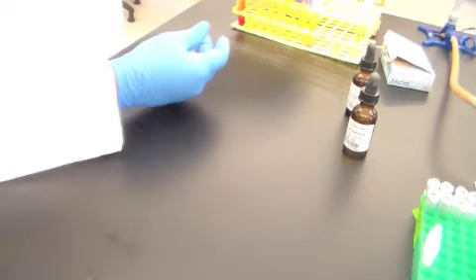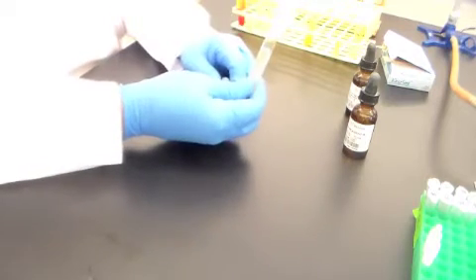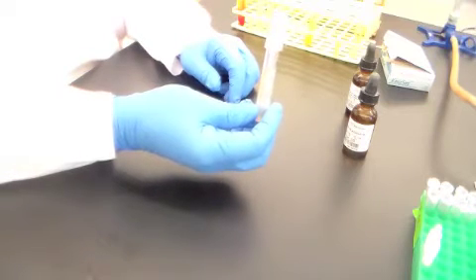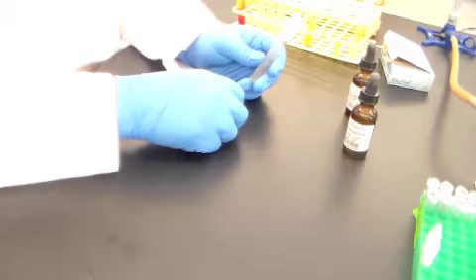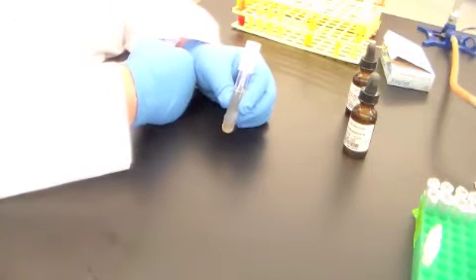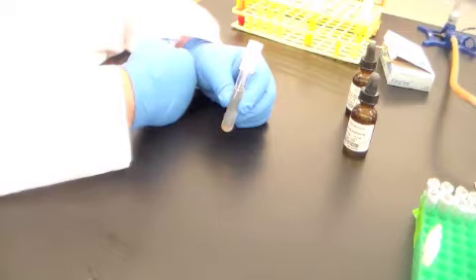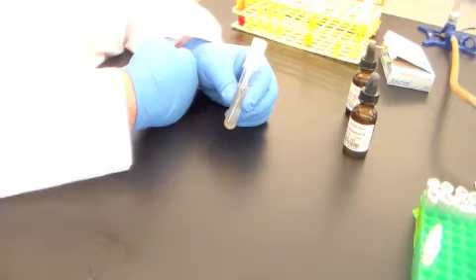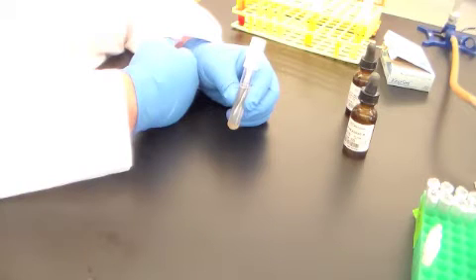So I have inoculated other nitrate broth cultures with a consortium of soil bacteria, which is kind of a fancy pants way of saying I put some soil in here and let it grow. The idea being that soil microbes, remember we talked in lecture about the bacterium Paracoccus denitrificans. That wonderful little soil bacterium is a facultative anaerobe. It has the ability with its electron transport chain to reduce oxygen at the end of its electron transport chain when oxygen is available. But when oxygen is gone, it can switch over and reduce nitrate to nitrite.